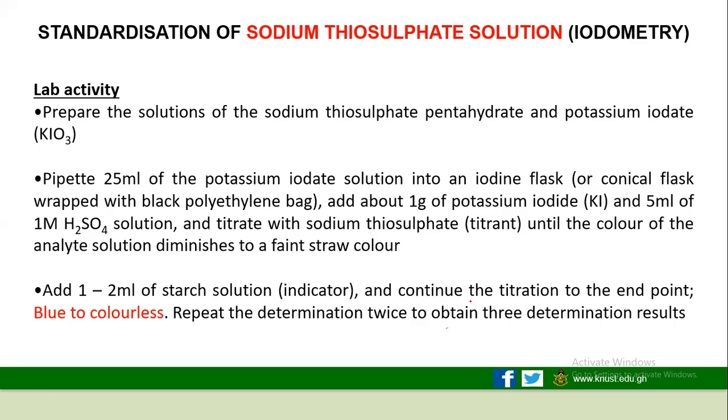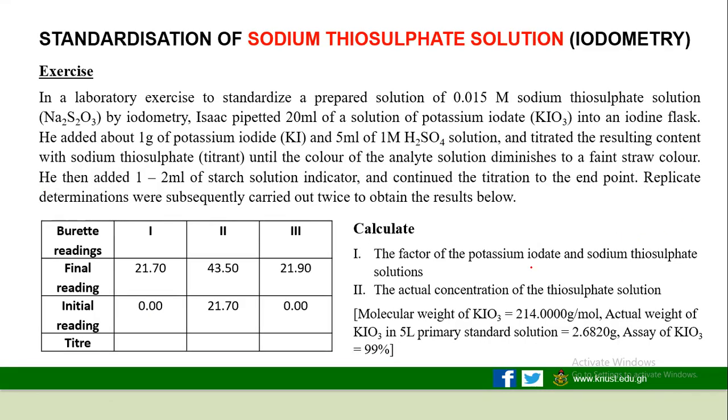So this is what we'll do in the experiment, in the lab during the experiment, and I'm sure the experiment will familiarize us with this procedure. Now let's look at the calculations. Good. So this is a sample question, and then they have already done the titration for us, so we just have to do our calculation. Now let's read it.